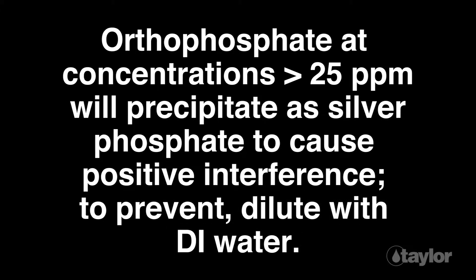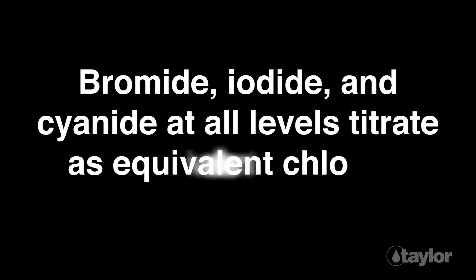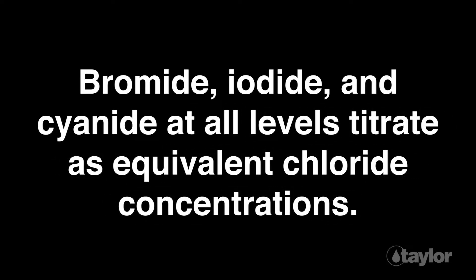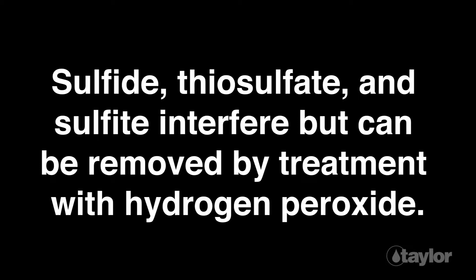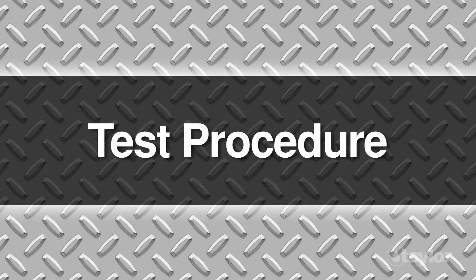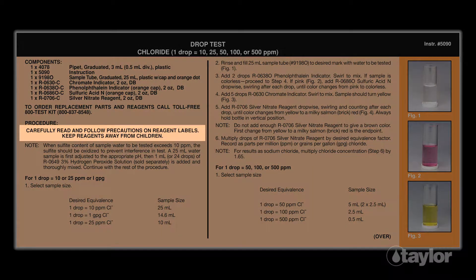To prevent interference, dilute samples containing more than 25 ppm orthophosphate with DI water. Bromide, iodide, and cyanide at all levels titrate as equivalent chloride concentrations. Sulfide, thiosulfate, and sulfite interfere but can be removed by treatment with hydrogen peroxide, which will be discussed later in this video.